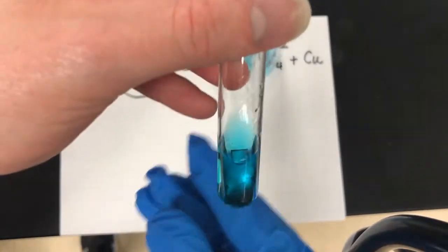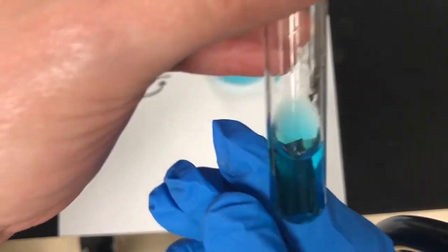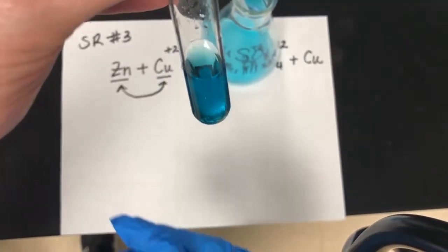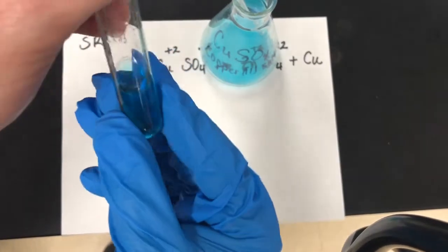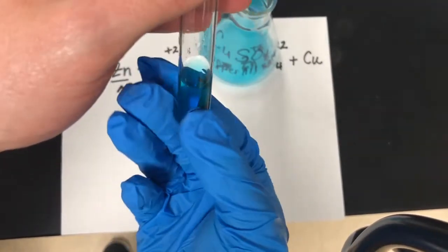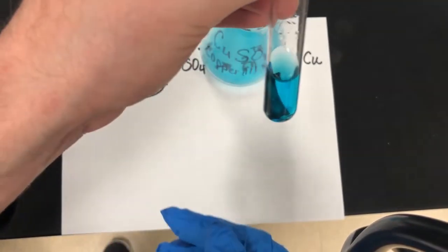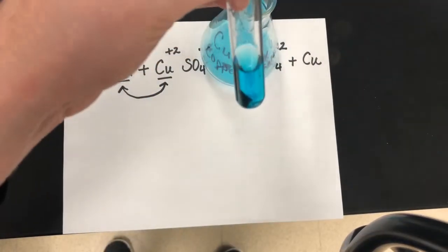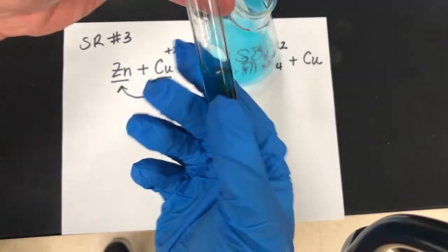Okay, so you can tell that the zinc is reacting and you're getting this brown metal on the outside of it, so it's plating out the copper. If I let this sit here for a while, it'll get more and more obvious. But remember, one of the things, evidence of a chemical reaction is going to be a change of color. Okay, so you can see the copper is beginning to plate out. There's a really good side that has a lot of copper, but it doesn't want to show.